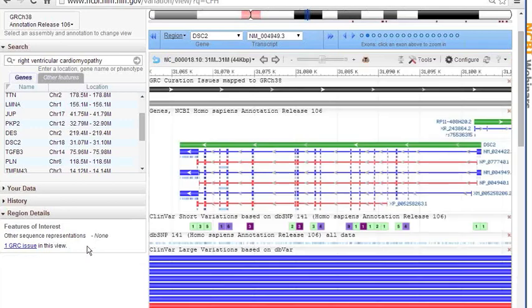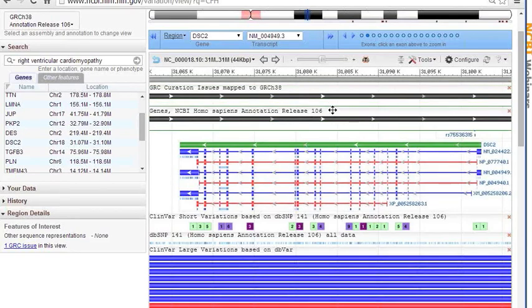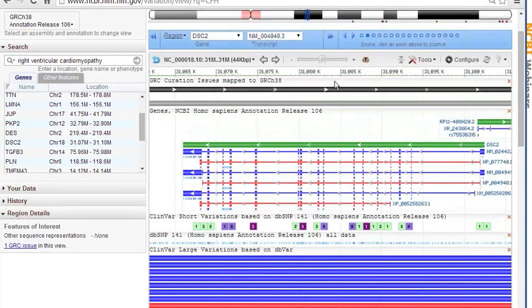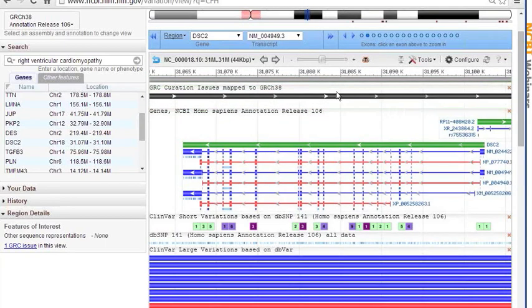And so here is the extent of a particular problem that the Genome Reference Consortium is trying to resolve. I'm actually going to show you another thing you can do with this. You can drag the tracks around if you want to. I'm going to pull it down so it's in the position where the sequence track is. If I do it right, it'll work. There it is. Now it's below the sequence track.